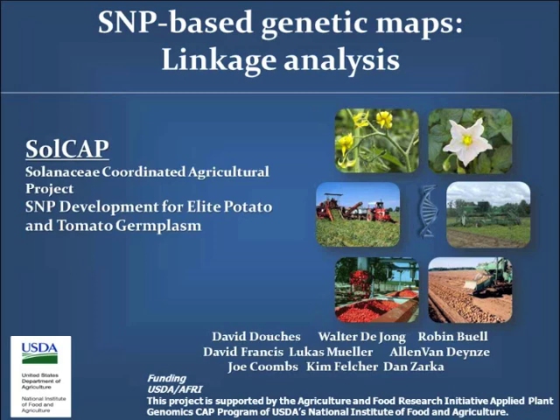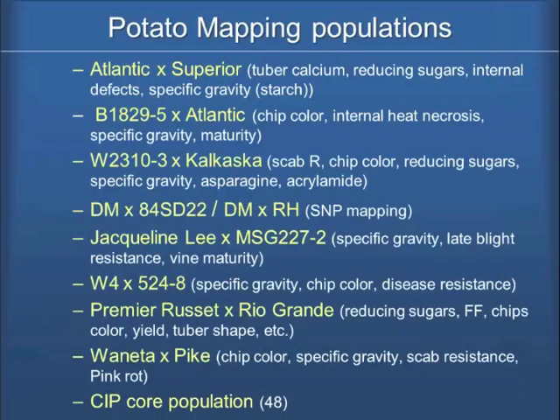And so what we're giving you here today is we've gone through all this process to create this SNP map. If you're going to generate a map, how do you take this data and filter it down into something useful? So we've got a procedure for you to follow, so you don't have to reinvent this process.